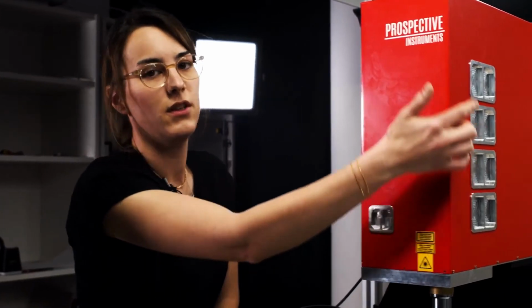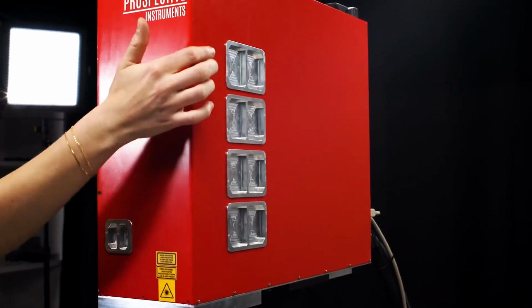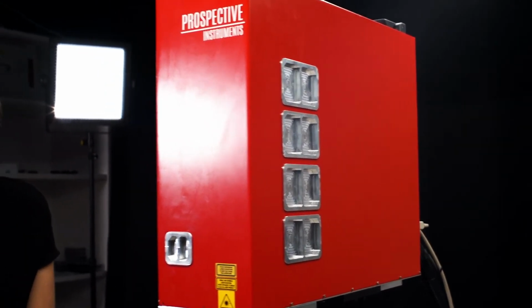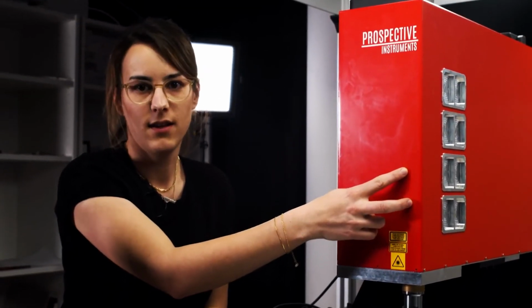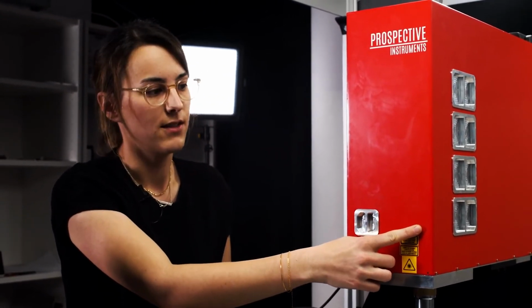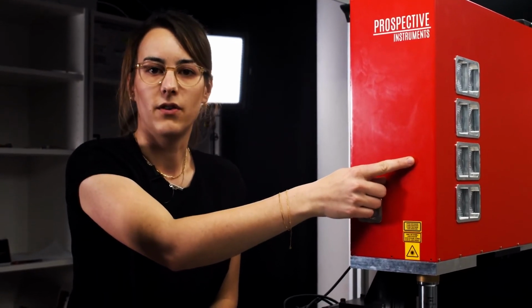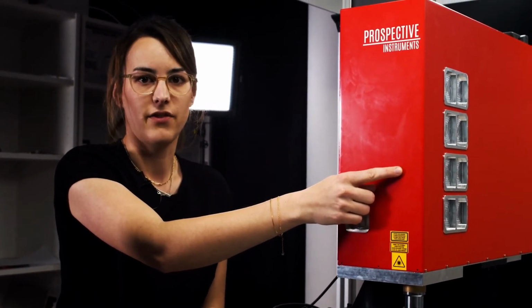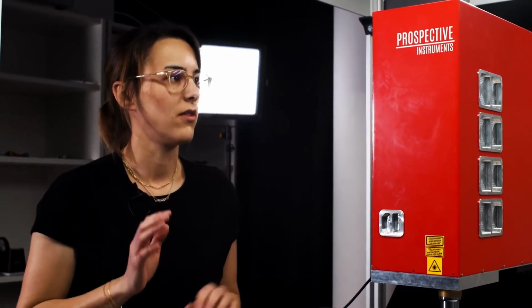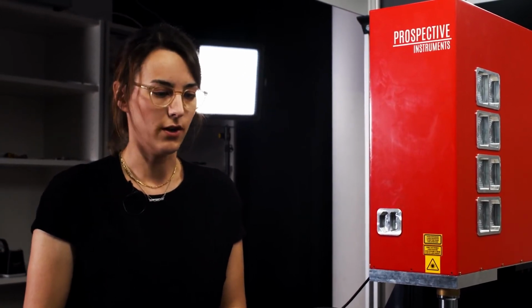On the upper side, you can see the filter cubes for the multiphoton imaging, which you can easily change. For today's presentation, we have two filter cubes built in. The first one is for the SHG imaging, which is at 520 nanometers in our case, and another for the two-photon imaging, which is at 595 nanometers. I think that is pretty much it about the configuration and the specs. Of course, we need a dark room for fluorescence imaging. Therefore, we turn off the lights right now and switch to my desktop. But of course, you can still hear me talking.